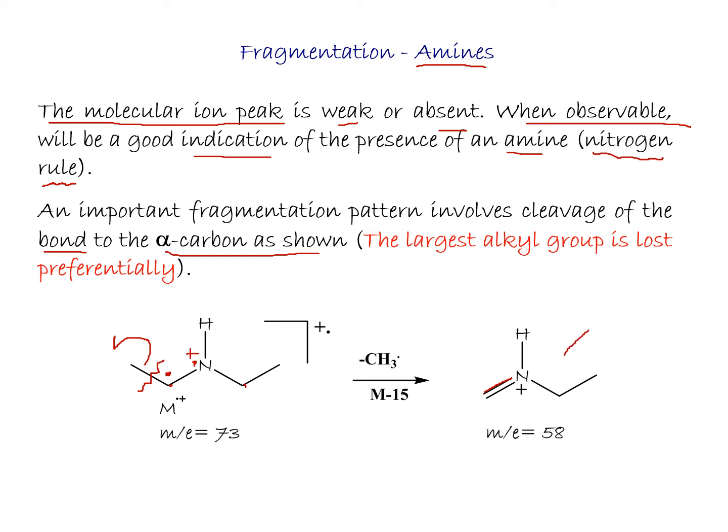Of course, this species is stable via resonance, having these two electrons on the nitrogen, and this is showing up at 58.